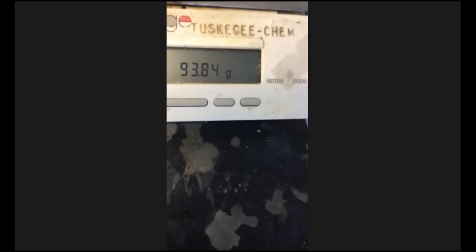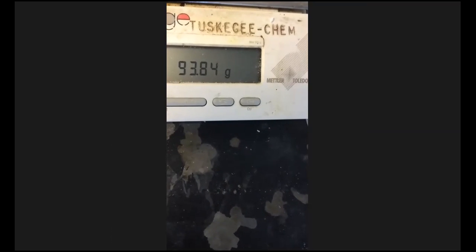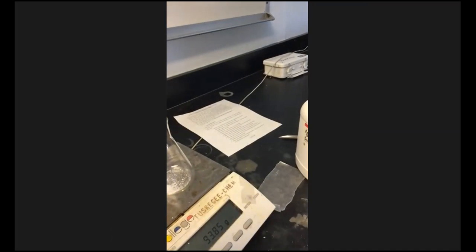So it's 93 point, let me see. You always want to wait for it to stop moving. 93.85. Let's go with that number. 93.85. So that's the beaker plus the salt mixture. So what's the mass of the salt mixture that I added?